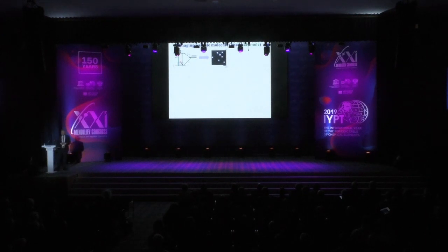Now, how do we image a single molecule? So first of all, we're pumping electronic transitions, a ground to excited state electronic transition. Now we're going to collect the emitted fluorescence terminating on vibrational levels of the ground state. And if we do that, we're going to be able to see each single molecule as a dot.